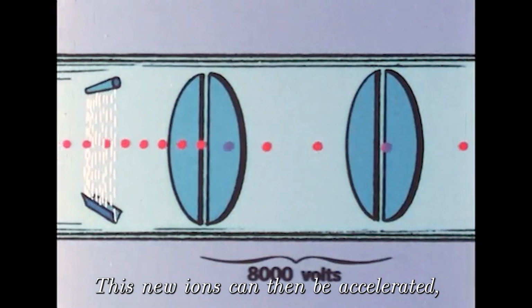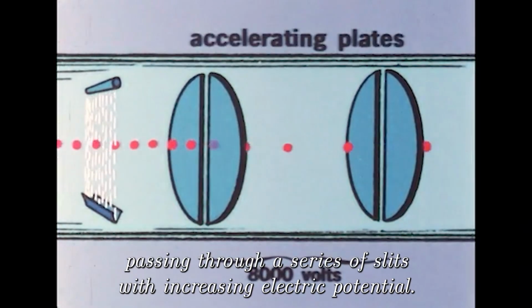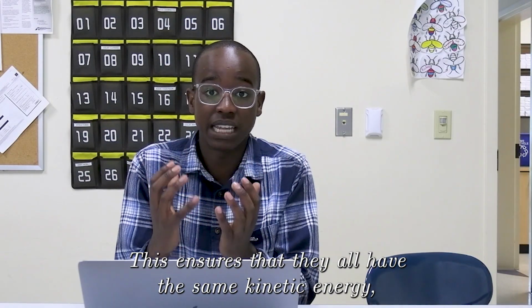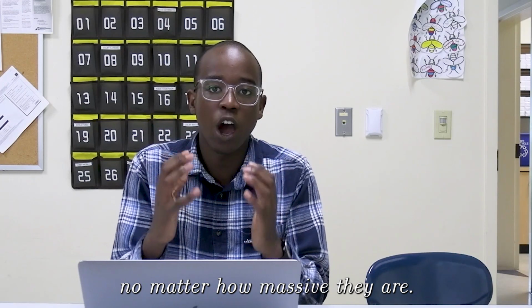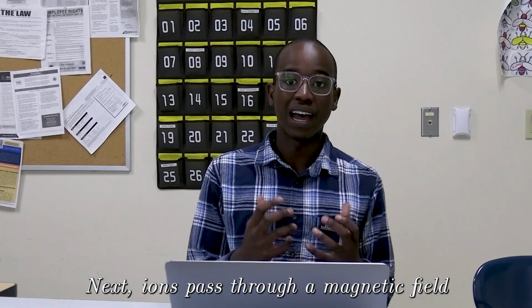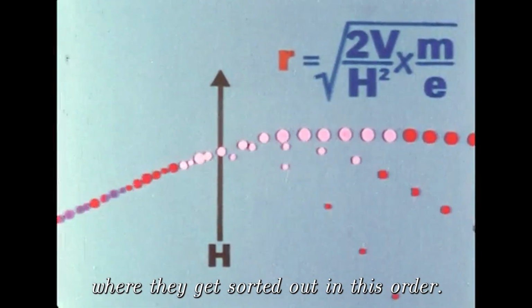These new ions can then be accelerated, passing through a series of slits with increasing electric potential. This ensures that they all have the same kinetic energy, no matter how massive they are. Next, ions pass through a magnetic field where they get sorted in this order.